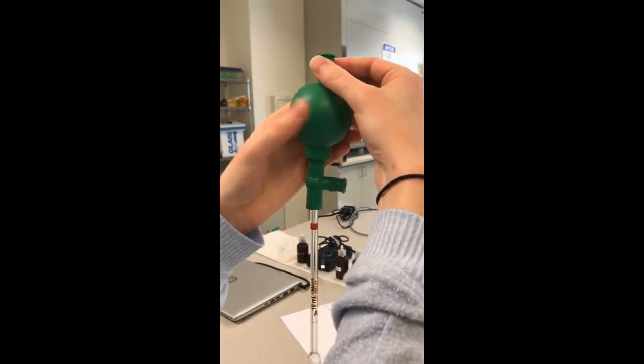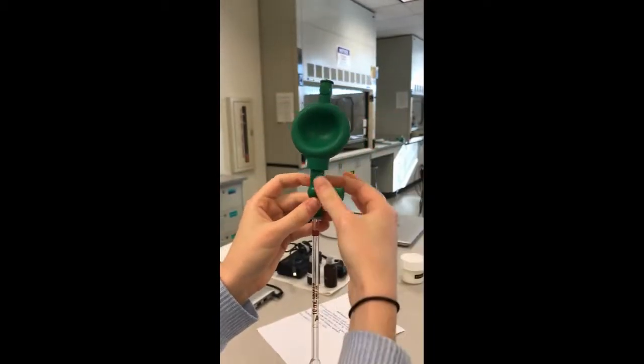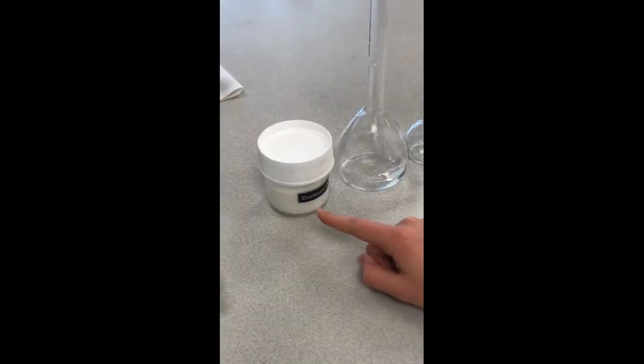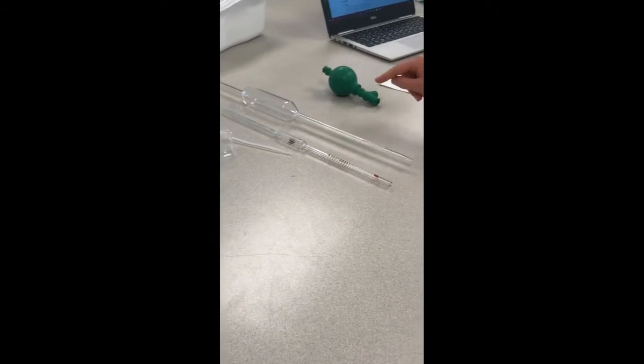To use a pipette bulb, press A to expel the air from the bulb, press S to suck up the liquid into the pipette, and press E to expel liquid from the pipette. This is sodium chloride, volumetric flasks, beakers, a reusable pipette, volumetric pipettes, and a pipette bulb.